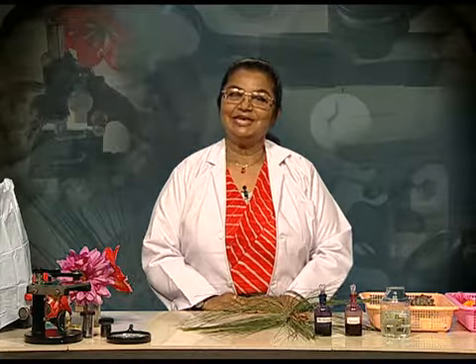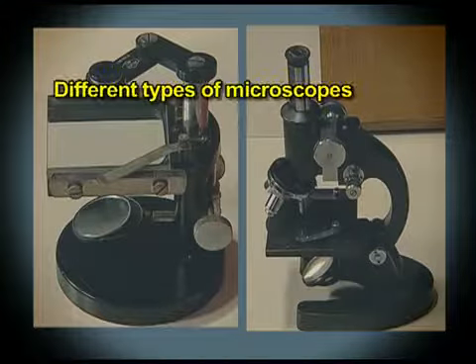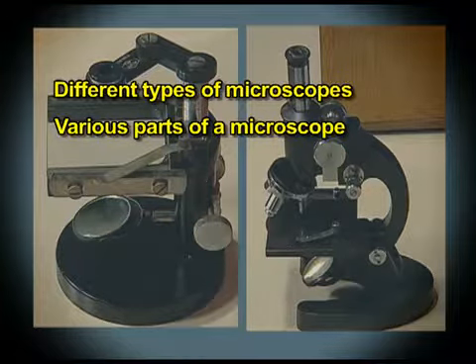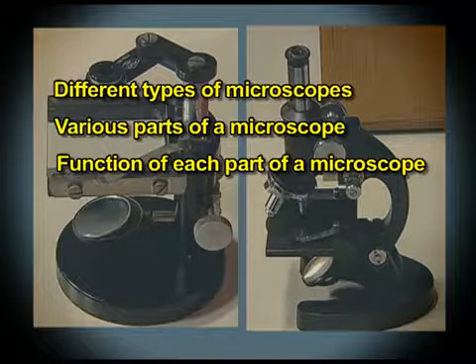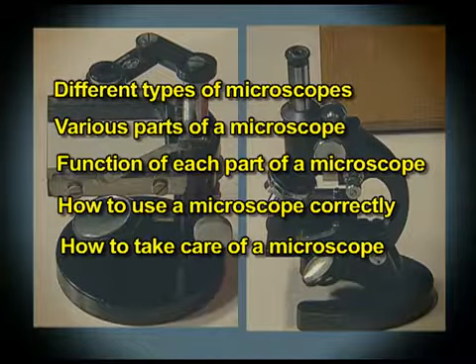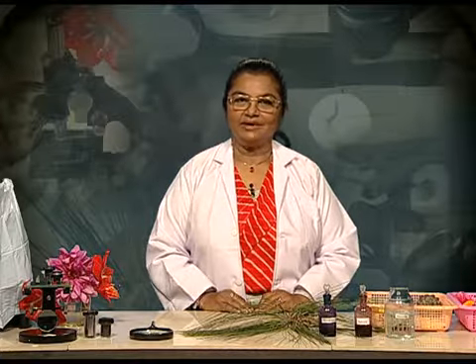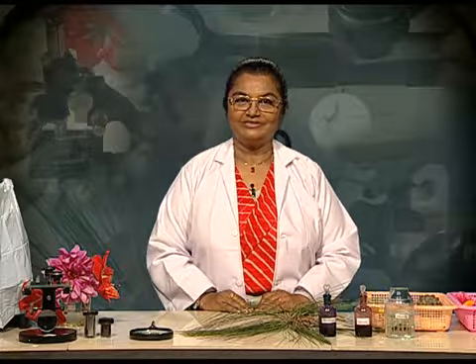So friends, in this video, we are going to learn about different types of microscopes, various parts of a microscope, function of each part of a microscope, how to use a microscope correctly, and how to take care of a microscope. We are going to look into three types of microscopes which are generally used in school laboratories.